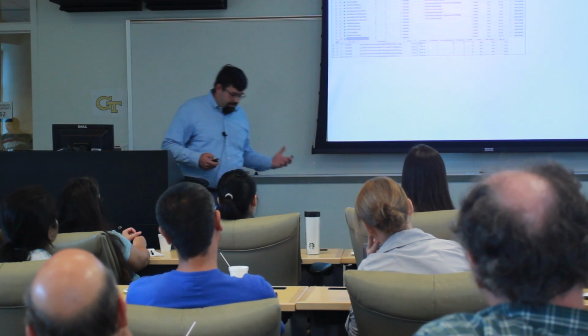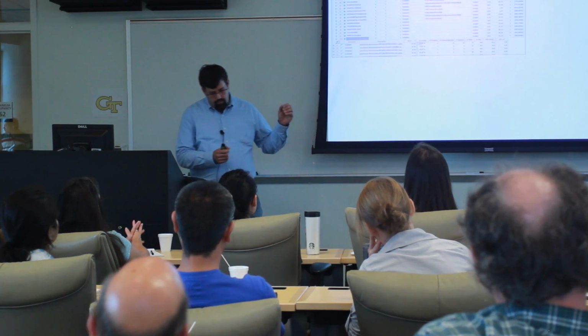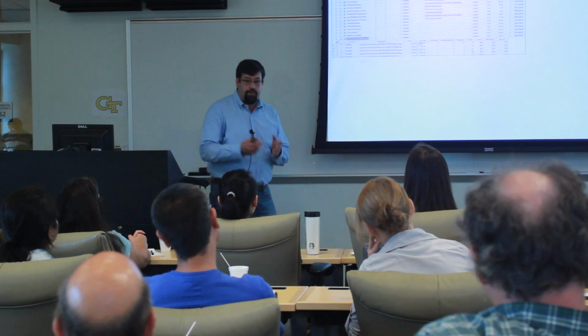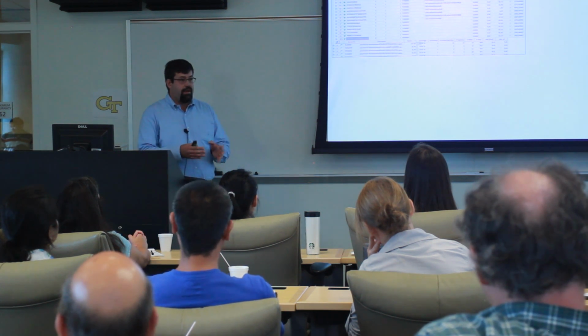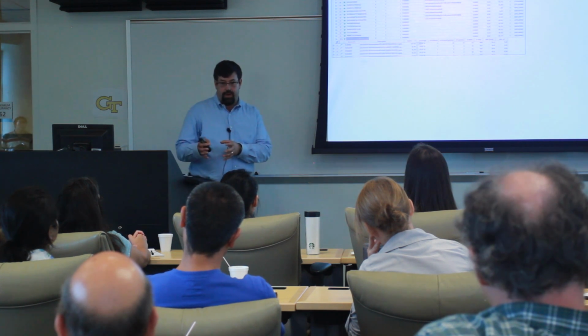So if we did an LCMS experiment, we might take a sample, and I'll talk about workflow in a second, separate by reverse phase liquid chromatography. UPLC is what we have coupled to the LTQ Orbitrap, and that's actually running with a nano electrospray ion source.